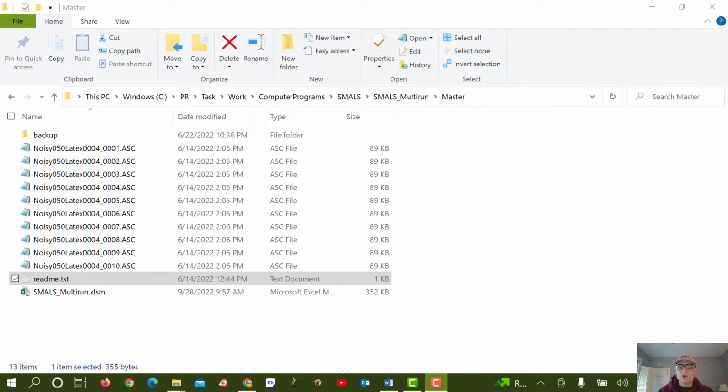Multi-run is what you do if you have data that are very hard to clean up. For example, you have a sample that had a lot of dust and there's really nothing you can do about it at this point in your life. Best thing, of course, is to have perfectly clean samples, in which case you would use just one run and our program Harvest.